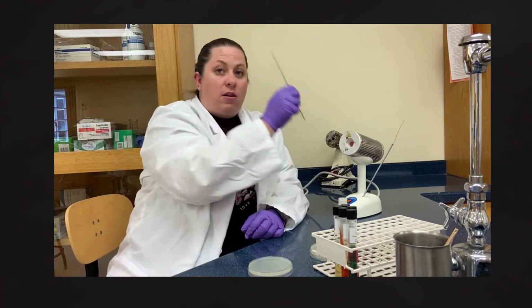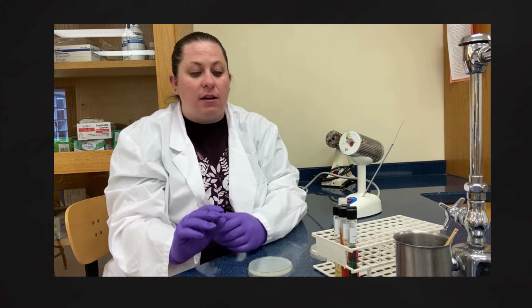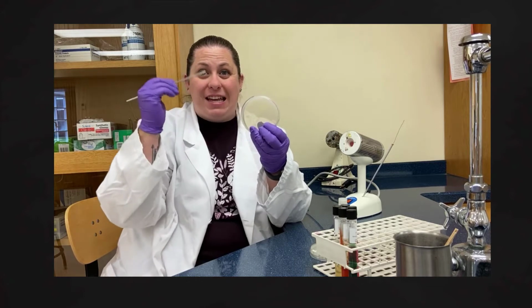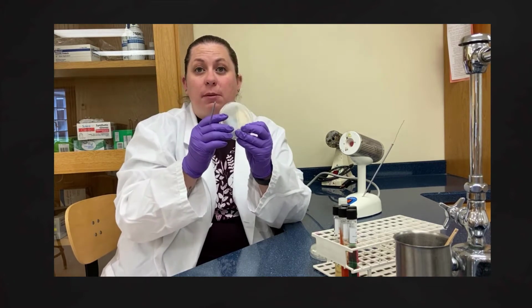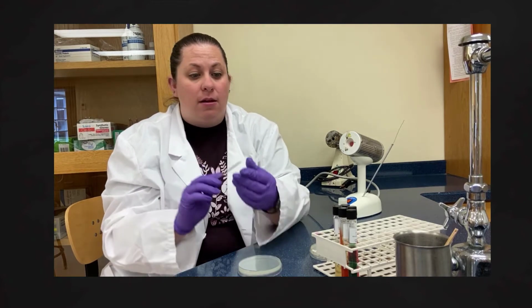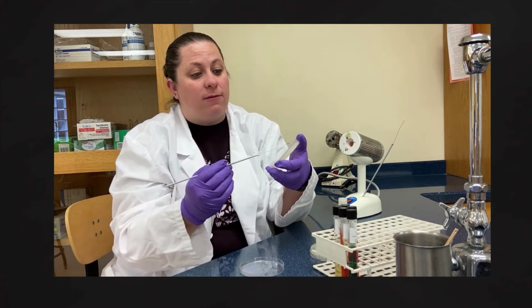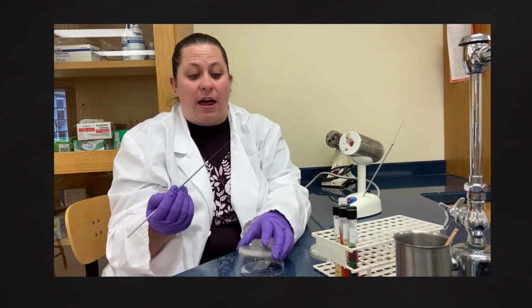We're going to then go through the process of sterilizing our loop. So our loop is going to be sterilized, and we are going to run it across that line that we just put in there. And we're going to do a zigzag type motion across there in order to spread that bacteria out. Once we see that it is cooled off, we're going to go back and forth in a zigzag pattern across that line.